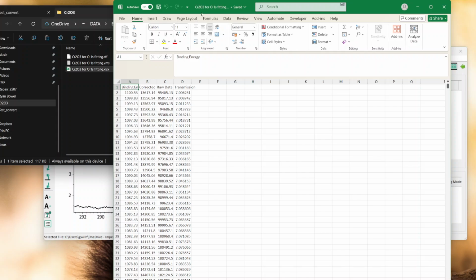And in KherveFitting, if I go back there, you have this 7, 5, or 4, 3 that was used. This is the raw data. And then you have a transmission function, and you have to divide the raw data by the transmission function. And that's when you get this corrected data. So it's all done exactly like CASA, except that CASA shows the raw data and it fits the raw data. It doesn't divide by the transmission. Later on, it will divide by the average transmission, as far as I know. But that's not done in KherveFitting. We divide every point straight by its corresponding transmission.